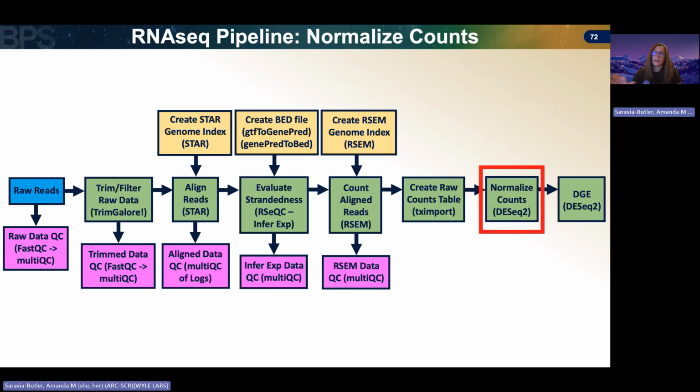So just as a reminder of where we are, we started off checking the quality of our raw reads, and then we went ahead and trimmed our raw reads to remove any adapters and low quality sequence data. We then checked the QC of those trimmed data to make sure that we did just that. We then, in part 2 of this lecture, and in the hands-on activity, talked about how to align our data. So again, we talked about different types of aligners, splice-aware and splice-unaware aligners, and then dove into splice-aware aligners, such as STAR, which is what we use in the GeneLab pipeline.